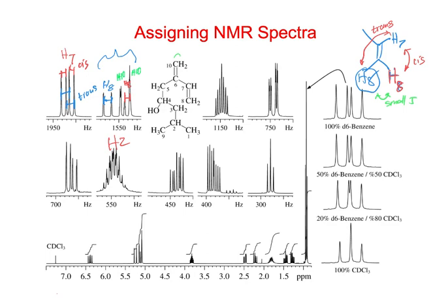So sometimes when you have a real small coupling like that, it'll just make it look a little bit broader, shorter. Yeah, and likewise here, right? This has got some kind of coupling, but then that could have not only the coupling between them, but it can have little couplings as well. So there's some other small couplings that are going on in there too.